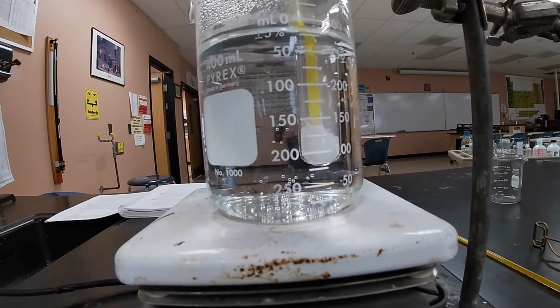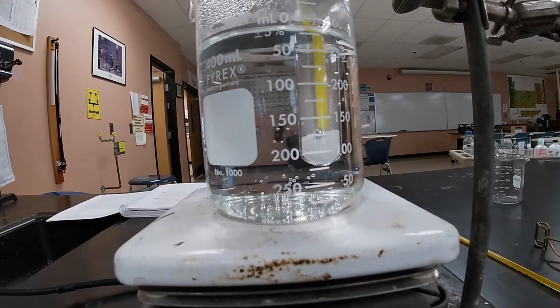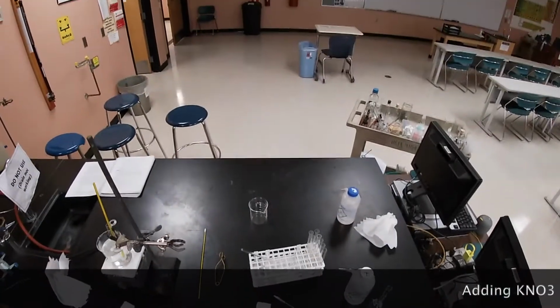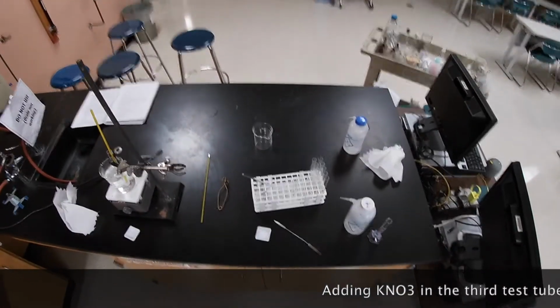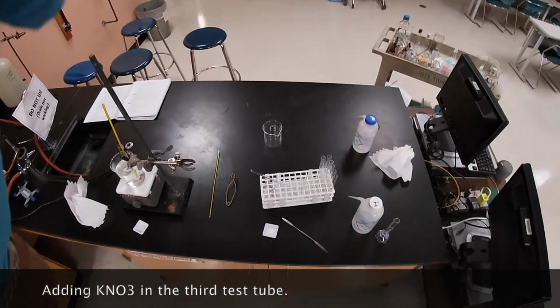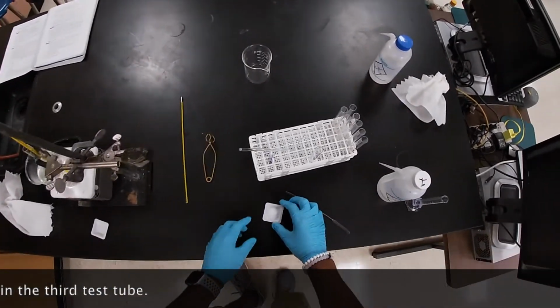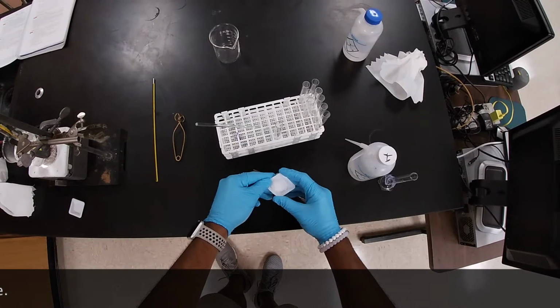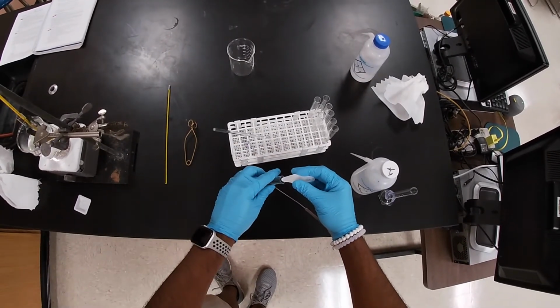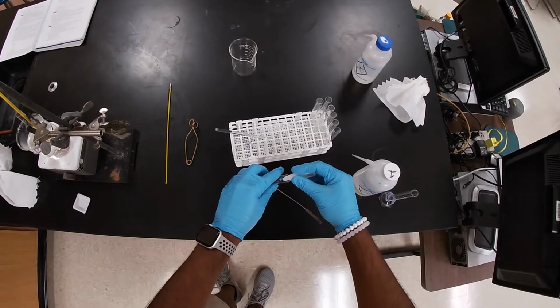So just go ahead and wait until it happens. So now I'm gonna go ahead and add my 5-gram into the test tube with 5 milliliters, right? So now we have a 5-gram sample.